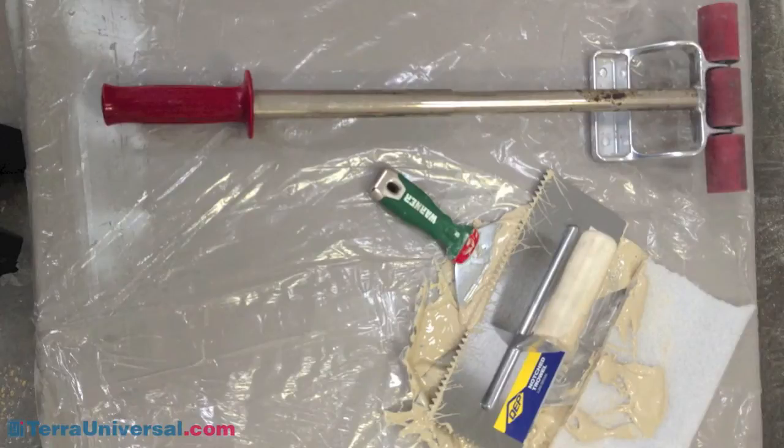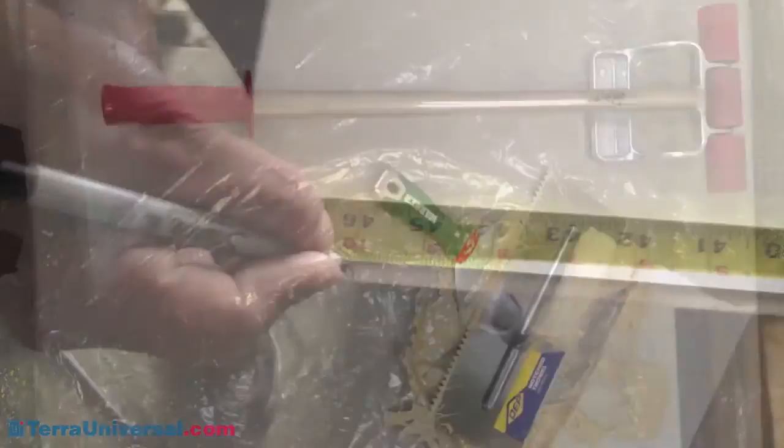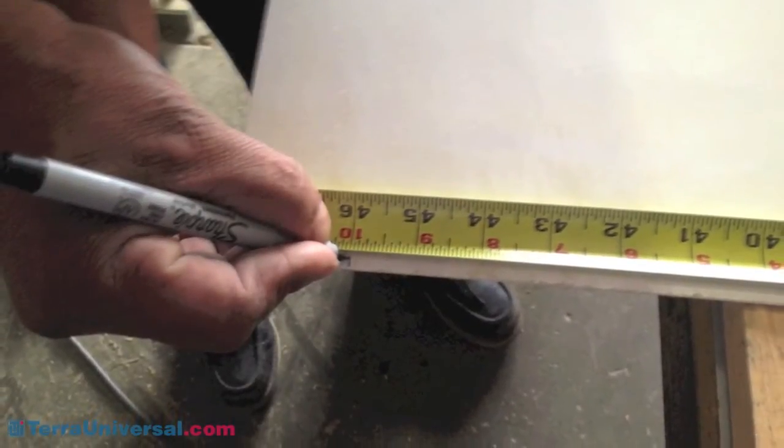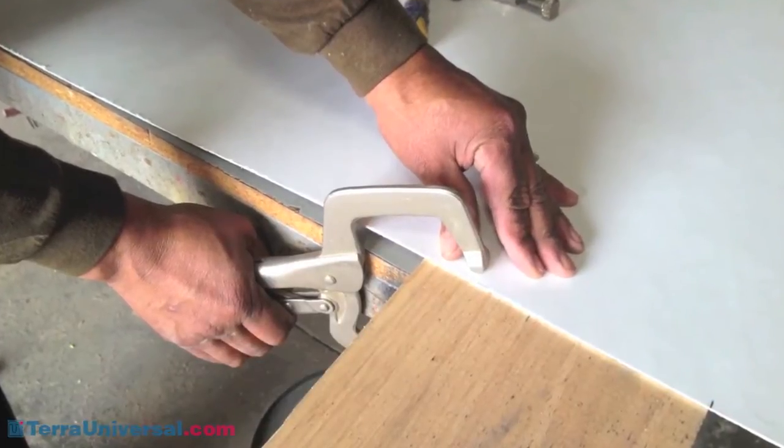The FRP installation manual lists all required tools and supplies. A team of at least three installers is needed. The initial step is to carefully measure and cut required panel sizes, keeping these guidelines in mind.